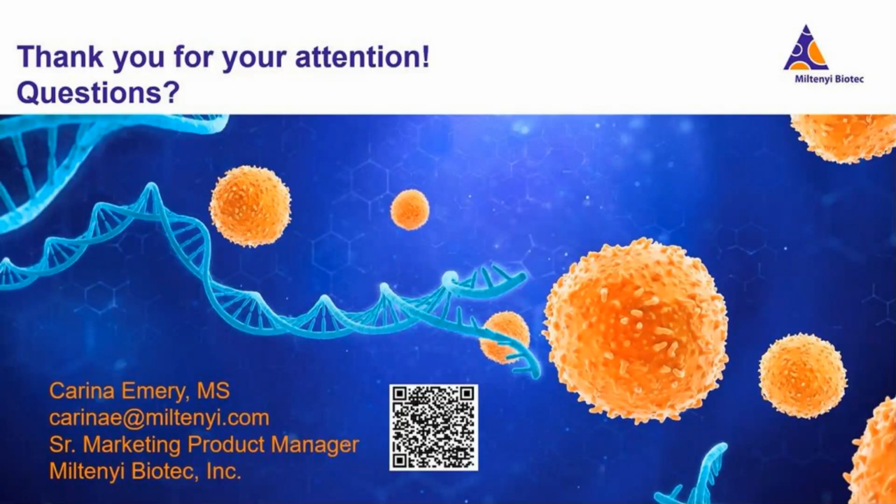Question 2, how should I count nuclei? Yeah, this seems like a really easy, obvious answer, but it's not. I think a lot of people struggle with counting nuclei because they use what they're used to, which is trypan blue on maybe an automated cell counter. And nuclei with trypan blue on your typical automated cell counter just do not work really well. Obviously all the nuclei are going to stain blue, but all your debris is going to stain blue, and you tend to not get very accurate counts.